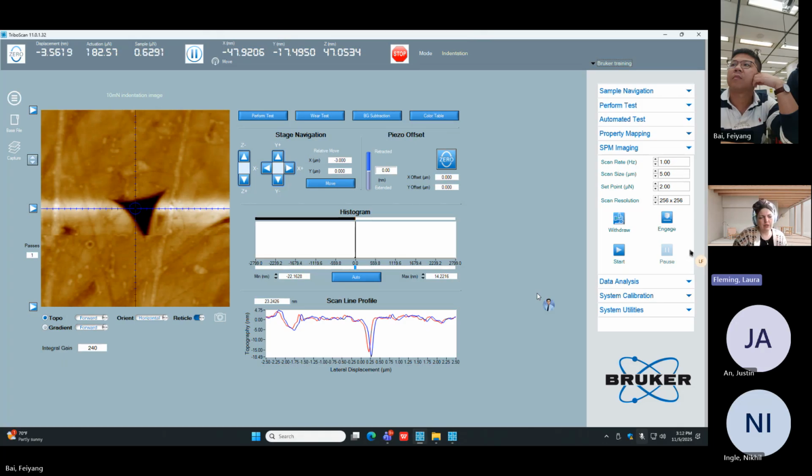If it was the opposite, if it was 5 nanometers, but my question is when it's 5 microns rough, okay, you want to do a 5 nanometer indent into what? What are we looking at there? What are you indenting into? Because if you think about it, it's like all these little tendrils, and you're going to hit part of it, I guess. And you're not going to be in contact well enough to get good hardness and modulus. You wouldn't have an accurate area to be in contact with.